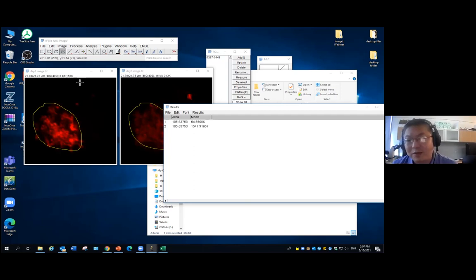So many things can happen. When you open the image, always check the bit size and the pixel scale properties to make sure they are the same. Then you can compare and rely on the results more.